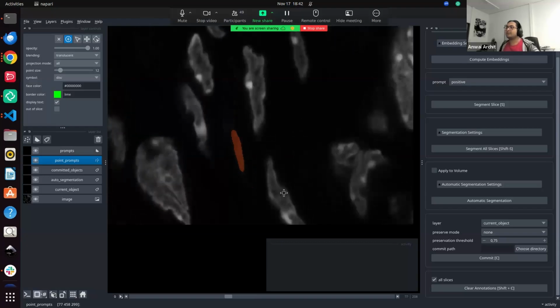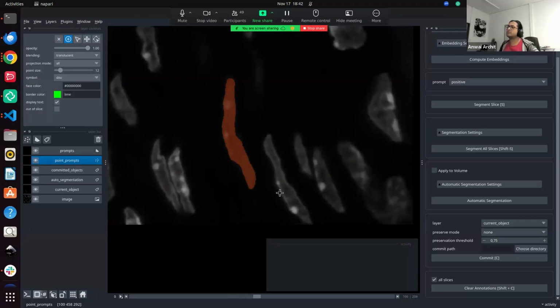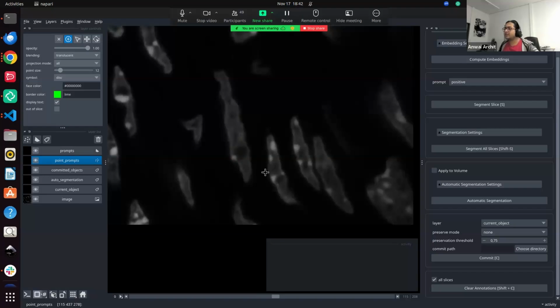Now, let's see how many planes, oh, this side was pretty okay. Oh, interesting. Okay, there were some mistakes over here. Let's put another rectification and say I will be happy thereon. Let's see.